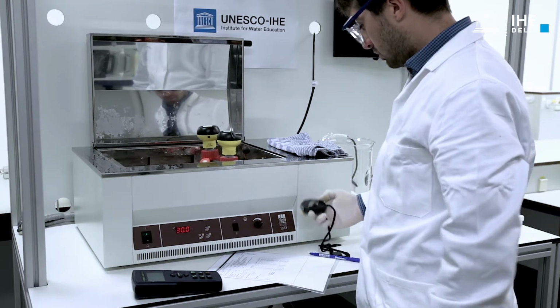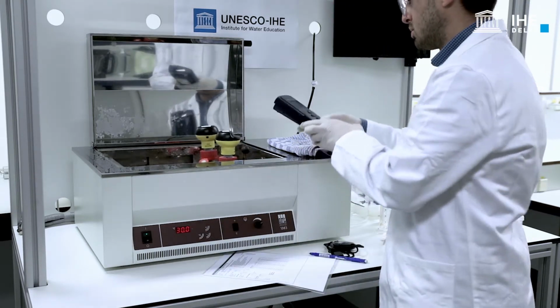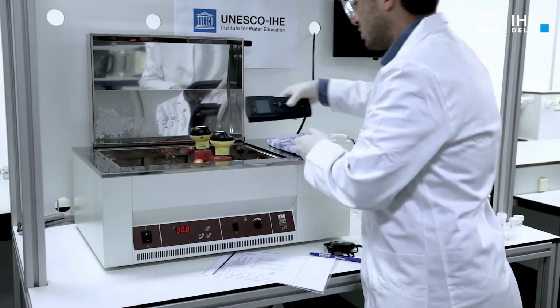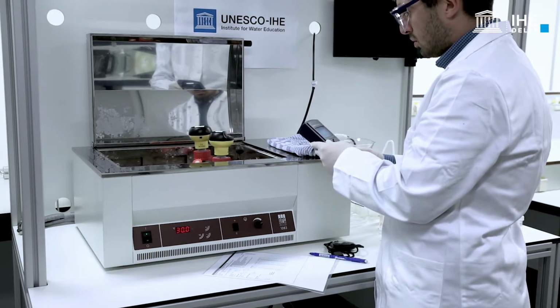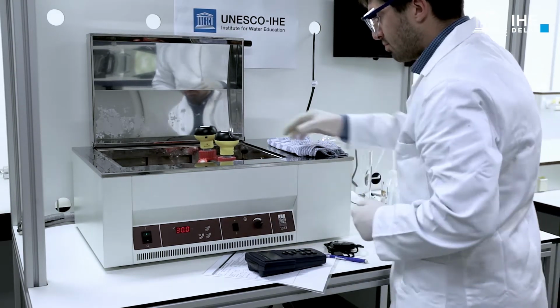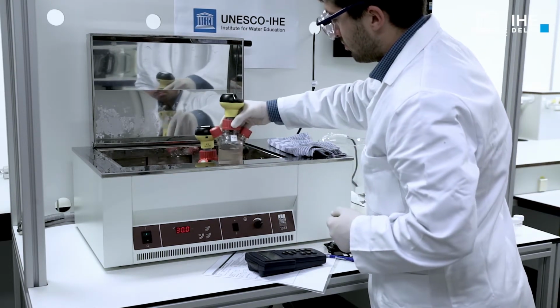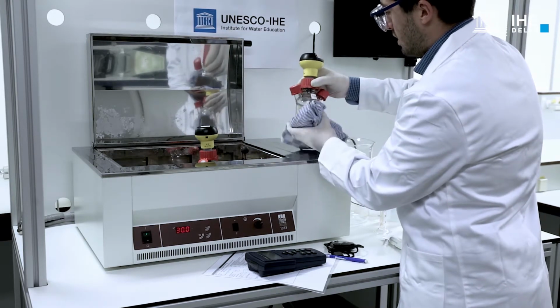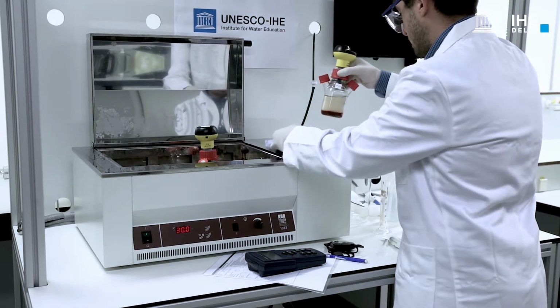Wait until sufficient data are recorded to be able to calculate the final endogenous rate by linear regression. The test can now be ended. Switch off the manometric system, stop the mixing, and check that the pH has been maintained within the desired range with a portable probe.